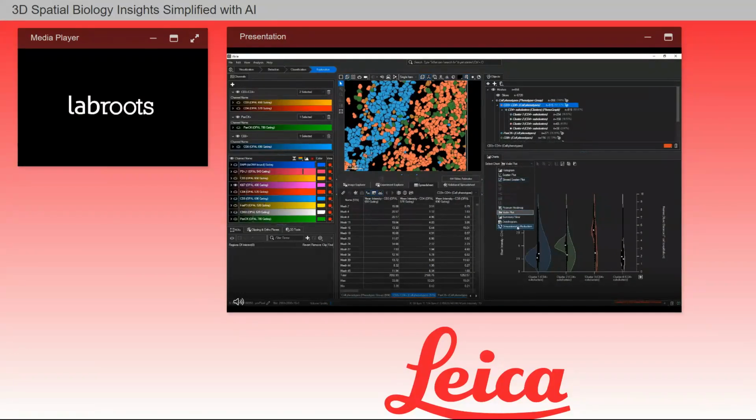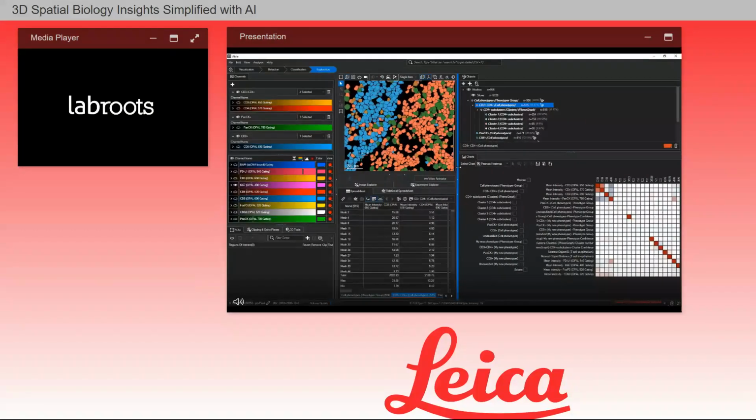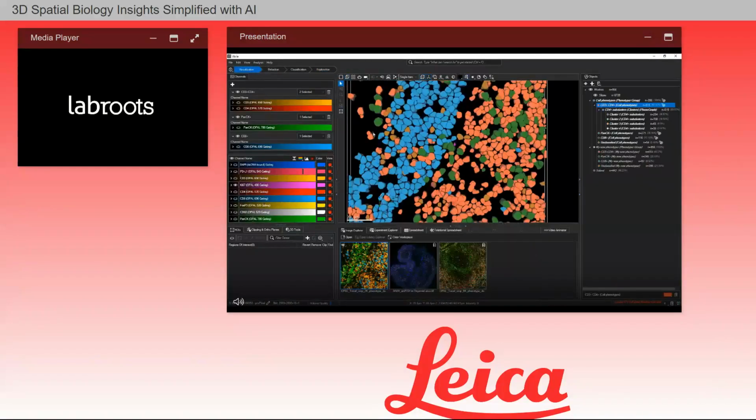These include dimensionality reduction and Pearson's heat map. With Pearson's heat map, you can look at the Pearson's correlation coefficient between different measurements. And finally, you can use the export function in the spreadsheet or in the charts to export the data to Excel for further analysis. Let's go back to the visualization tab to examine the image more closely.